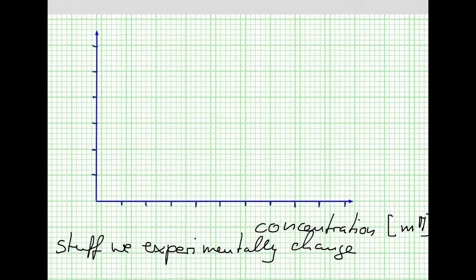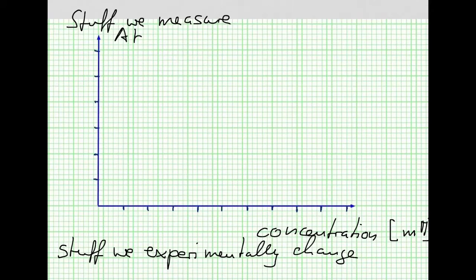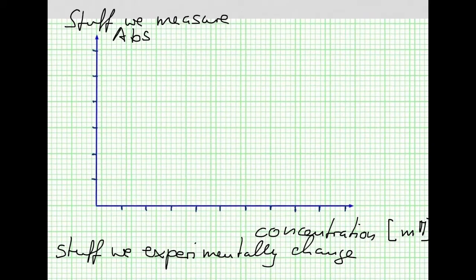On the y-axis, we plot what we measure. So here, stuff we measure. In this case, we measure the absorbance.